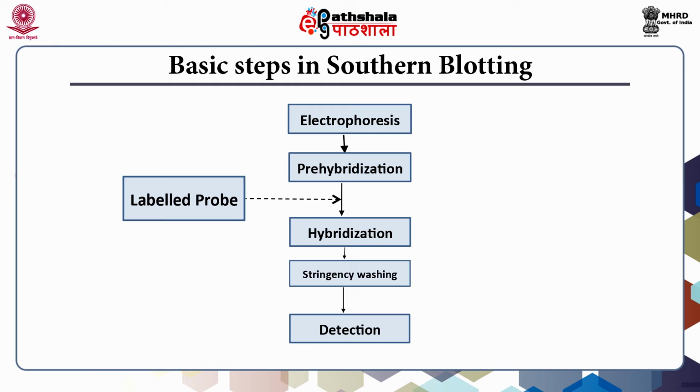In the remaining part of my presentation, the focus will be on the practical aspects of the Southern blotting technique. This will include preparation of DNA fragments, electrophoresis of prepared DNA, blot transfer of DNA fragments from gel to membrane, hybridization of membrane with a specific labeled probe, and analysis of results in the autoradiogram.